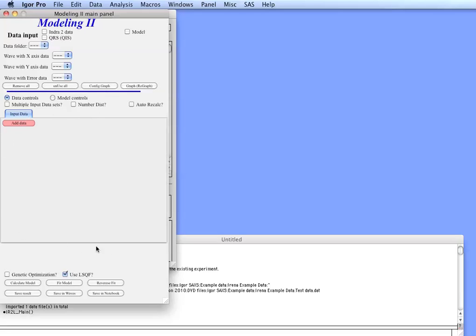These are data input controls which are very similar to all the other ones. Down here in the tabbed area we have two sets of data controls: one is for data and the other one is for model. So let's first input some data in there.